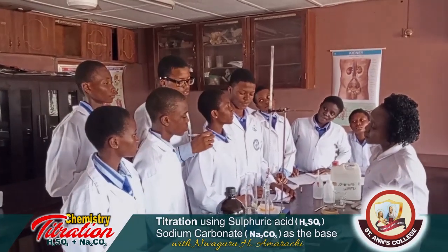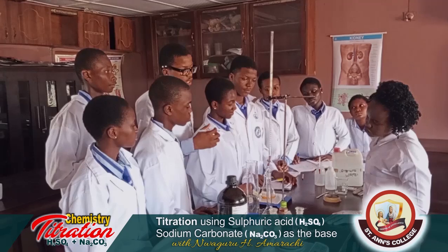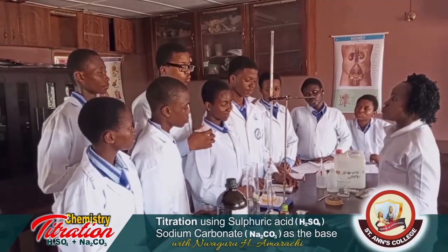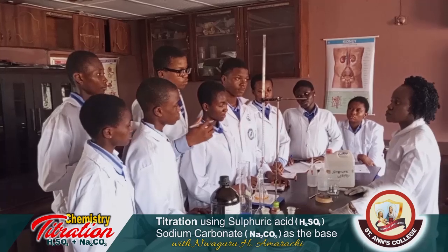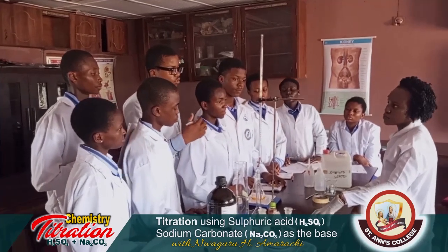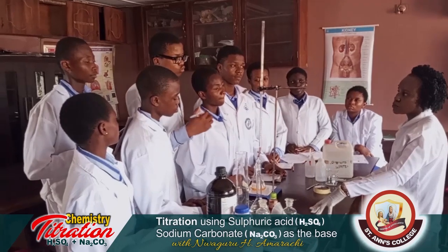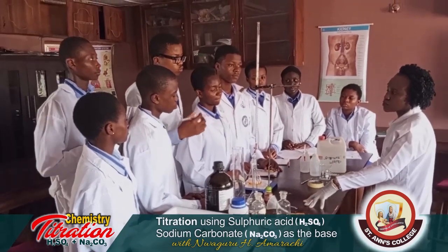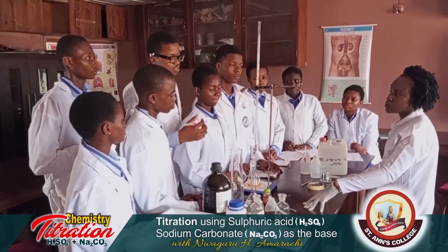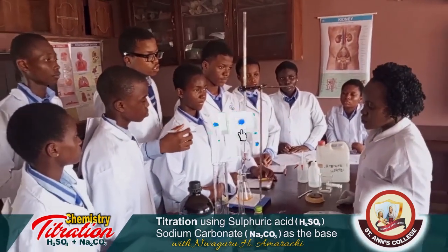Excuse me, madam. Okay, please, ma'am. In some of the titration questions I've seen, they usually work with 3 drops of the indicator. So my question here now is, the 2 drops that we use today and the 3 drops that I always see people use, what is the main difference in this change in the drops of the indicator?